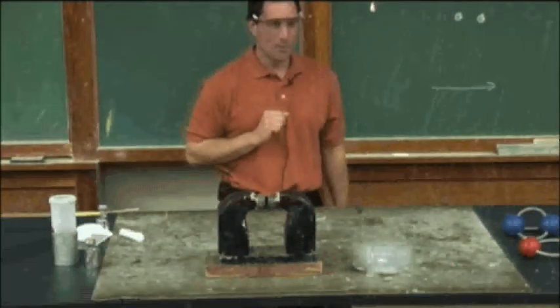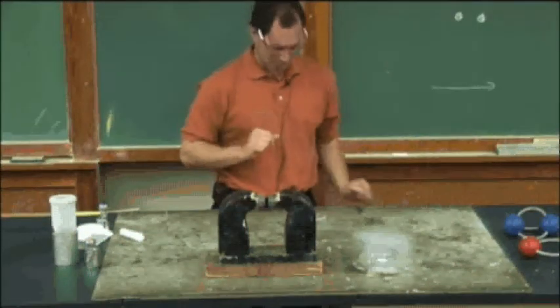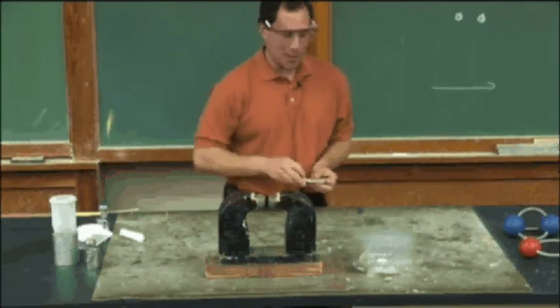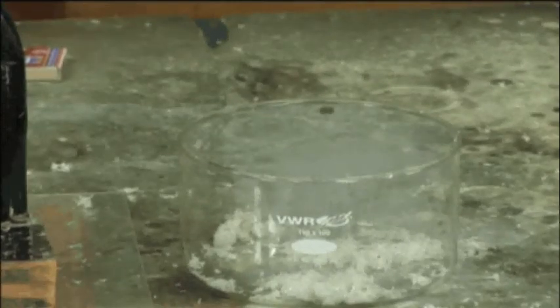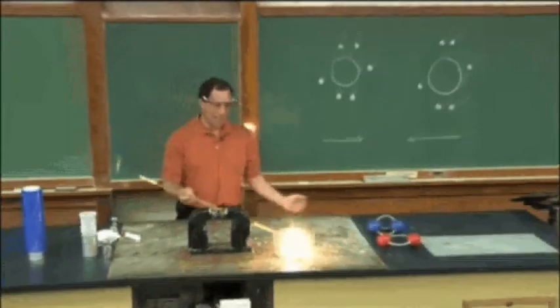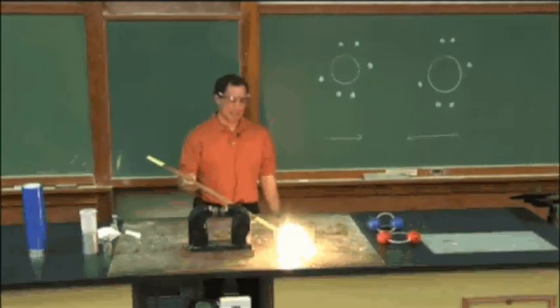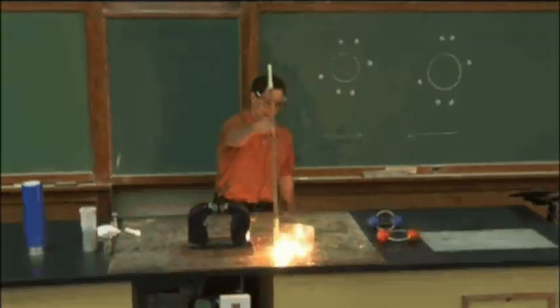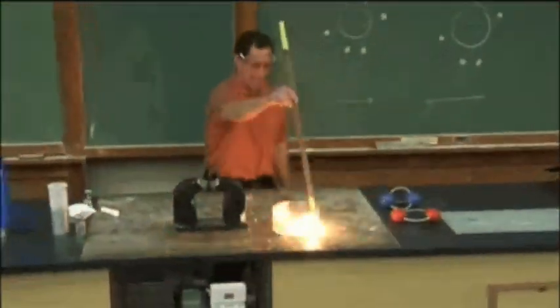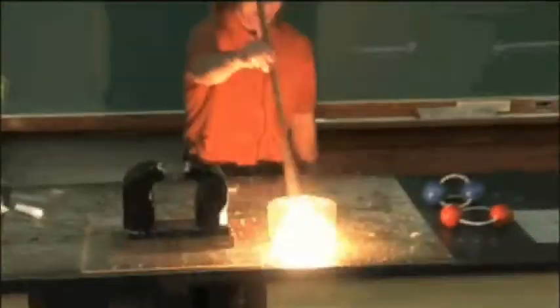That was quick. Have some little flakes all over the place. There might still be a little bit of oxygen inside that dish. We'll check that by putting a little wood splint inside there. And again, being cautious, we want to dispose of that oxygen so as not to remain inside the room. Look at that splint glow. Get rid of some of the oxygen that's residual.